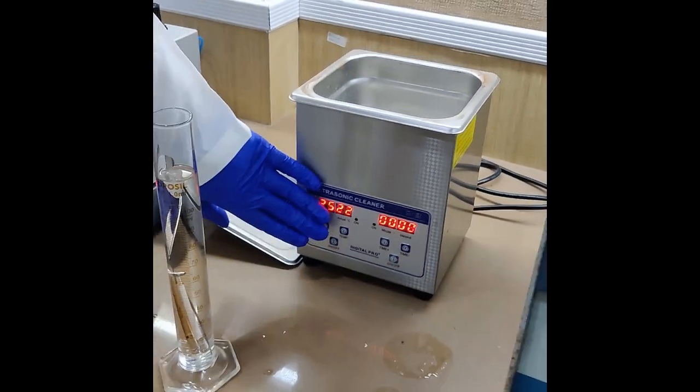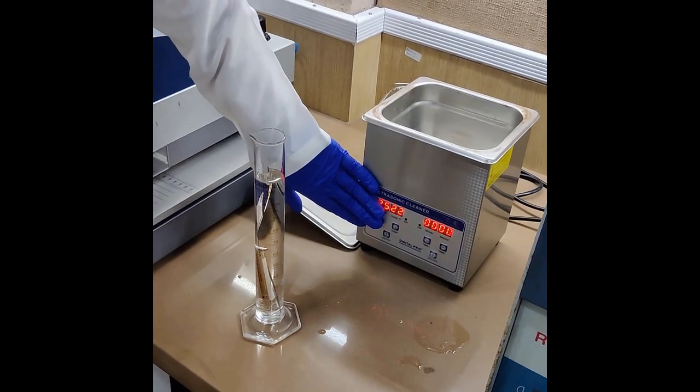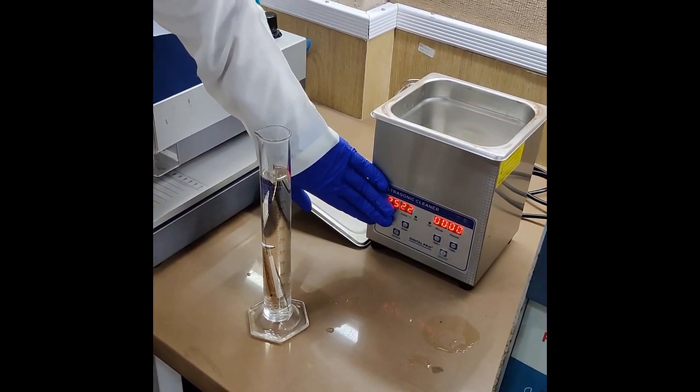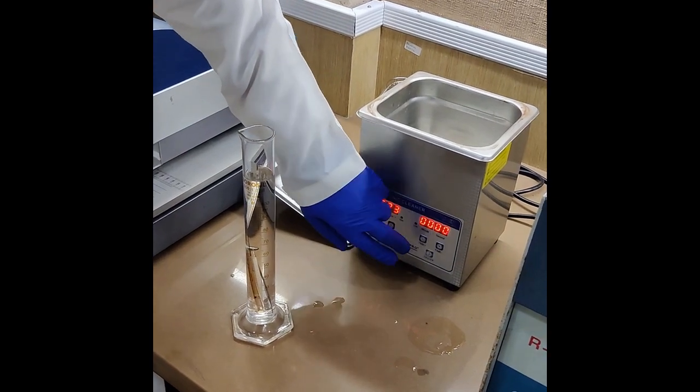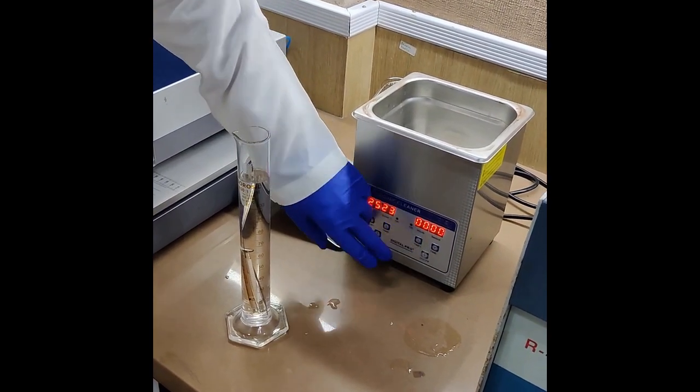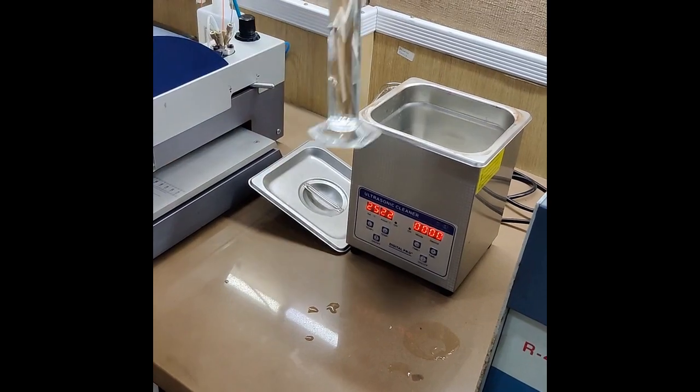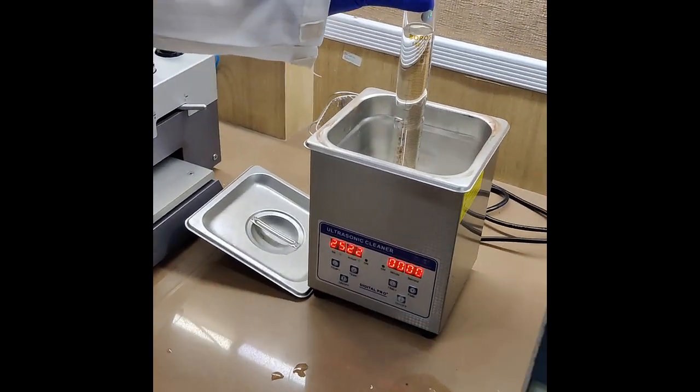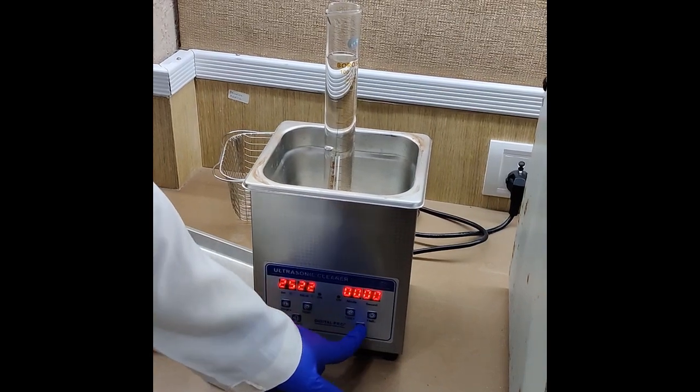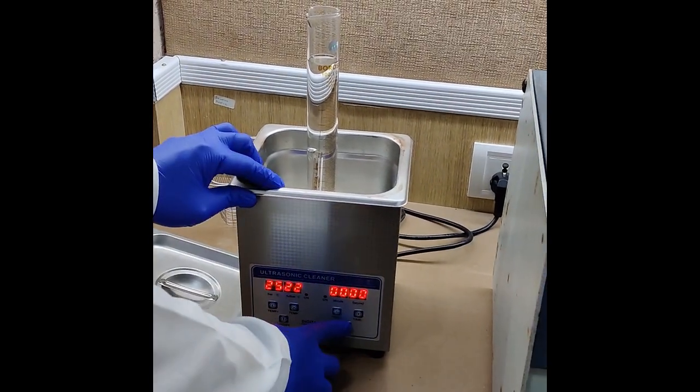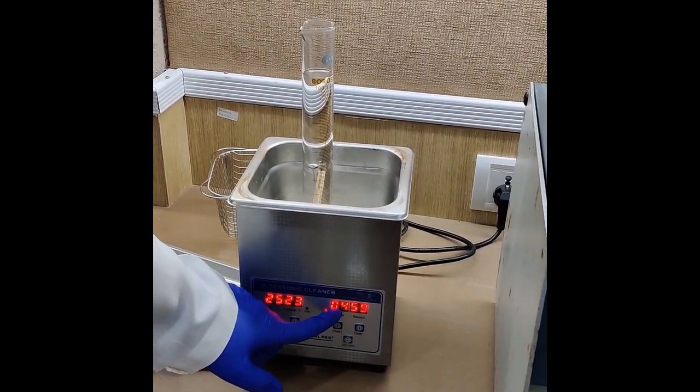If a temperature option is available, you can select a higher temperature, but please make sure it is not more than 60 degrees Celsius and the time has to be set for 20 minutes. Simply put the measuring cylinder in the sonicator bath and switch it on. Note the timing—it should be done for 20 minutes. We will be giving 4 cycles of 5 minutes each.